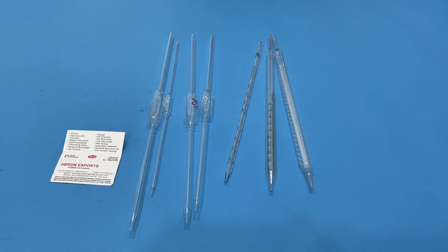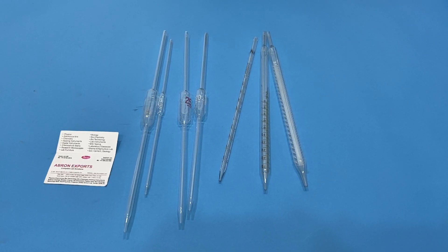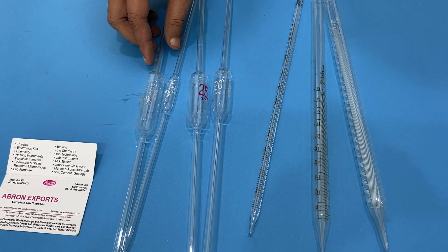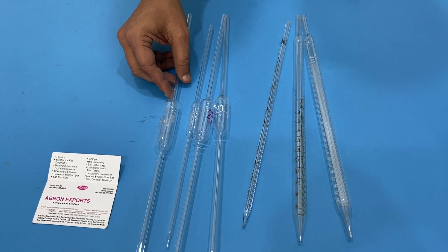This is another video by Abravanxports. I welcome you all. Here is a borosilicate glass pipette. Sometimes they are different types. This is called a volumetric pipette, or pipette with a bulb.